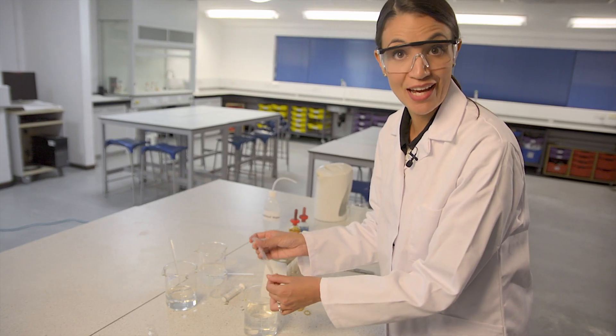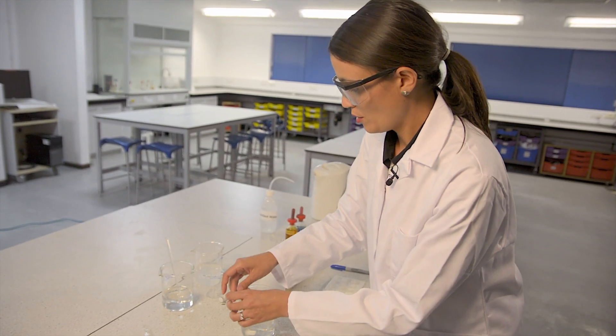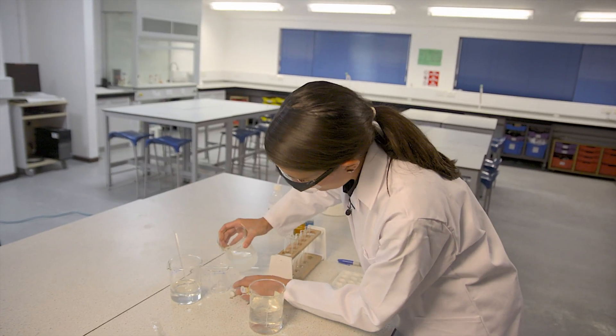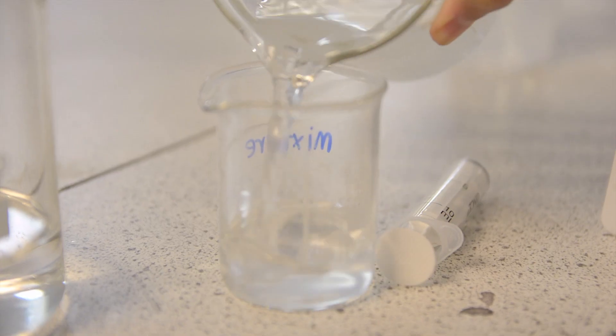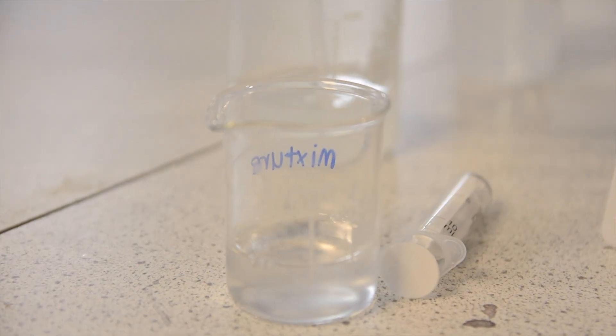Now I'm ready to add the starch and glucose to the tubing. I'm going to mix together some starch suspension — just 25 ml or so — and some of this glucose solution.